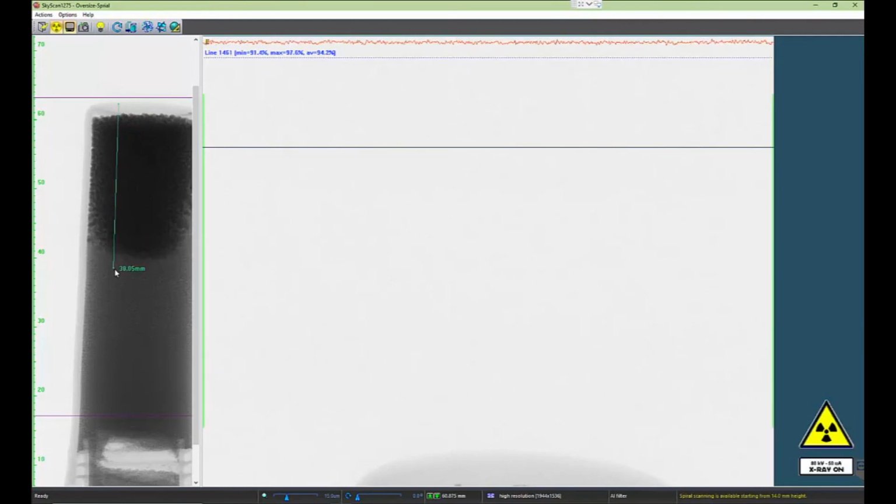I'm left clicking, by the way, you see that it shows the total height. If I hold down the control key and do the same thing, now it's showing me the height in yellow and also a parentheses 2. And so this is going to be representing the number of scans that will be required to collect this sample height from the start of my line to the end of my line using a circular scan.